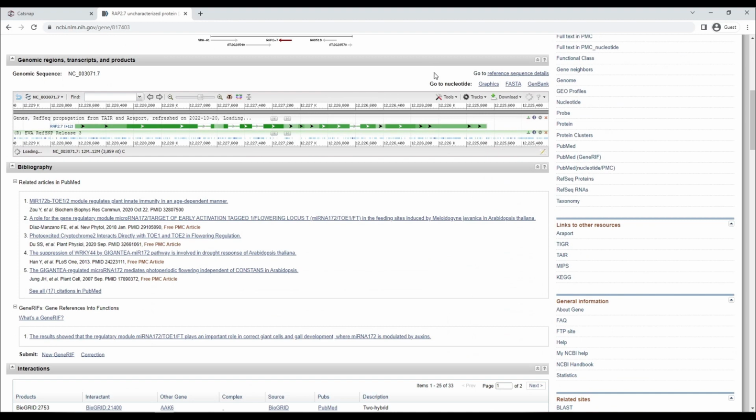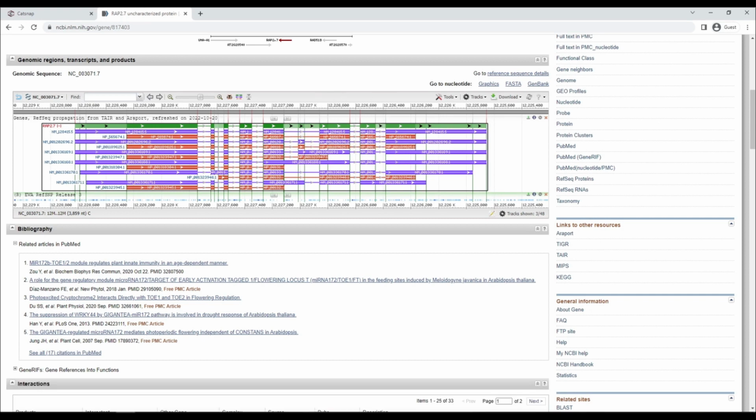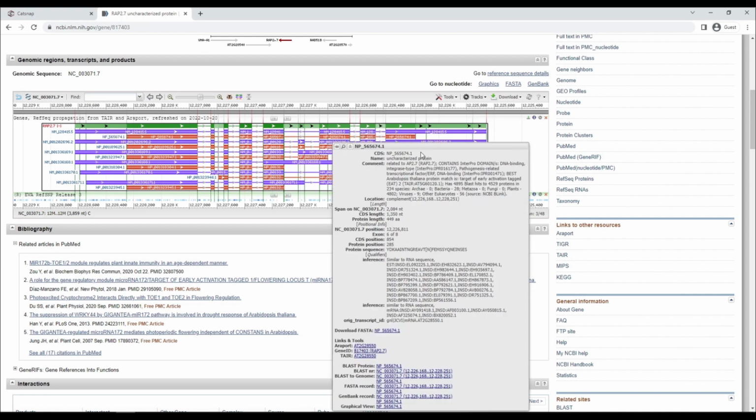Unfold the gene structure by left-click on the green gene diagram. Purple diagrams correspond to mRNAs and red diagrams correspond to proteins. I am interested in this event where an exon is skipped. I need two isoforms which only differ in the presence of this alternative exon. Here they are. To copy their accession numbers, hover your mouse over the corresponding isoform.